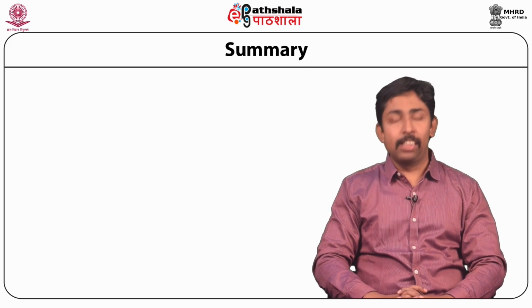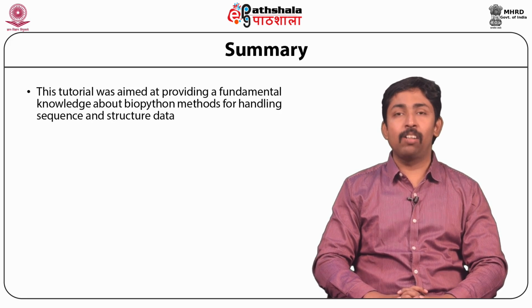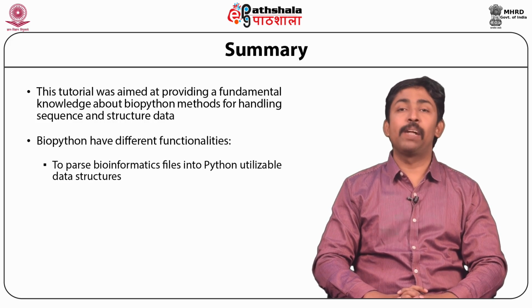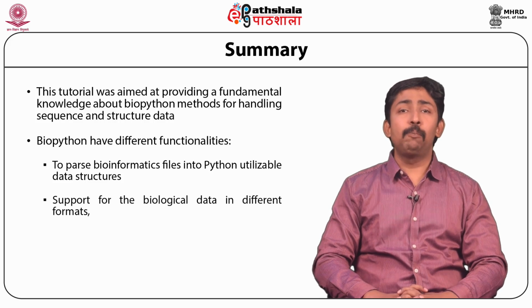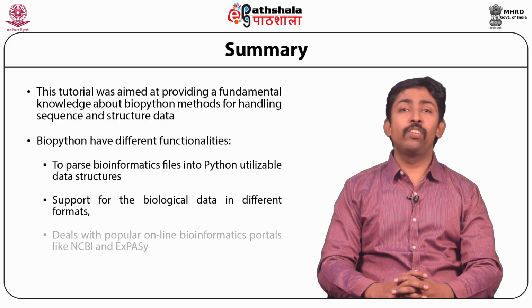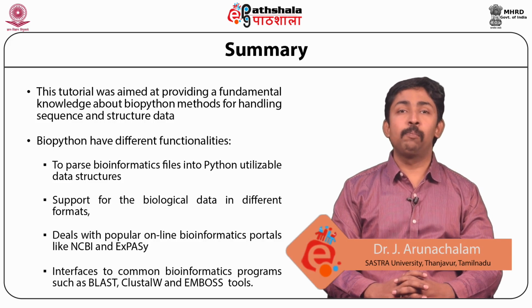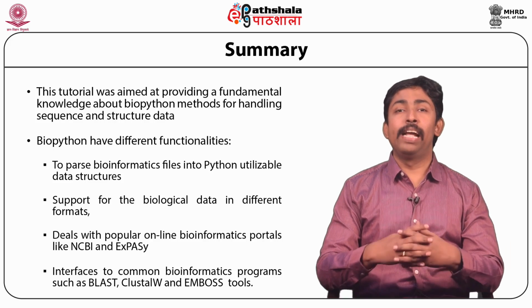So students, let's now summarize what we have learnt in this module. This tutorial was aimed at providing fundamental knowledge about BioPython methods for handling sequence and structure data. BioPython has different functionalities to parse bioinformatics files into Python-utilizable data structures. Support for biological data in different formats is also available in BioPython. It also deals with popular online bioinformatics portals like NCBI and ExPASy. Interfaces to common bioinformatics programs such as BLAST, ClustalW and EMBOSS tools were also explained in this tutorial.